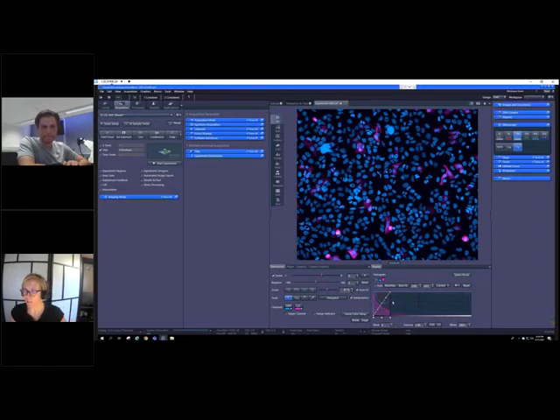Thanks, Frank. That was incredibly quick and easy. I actually see that there's a question in the chat that seems relevant to what you just showed, so I'm going to go ahead and ask it now. Can Zen easily do cell counts in each well?